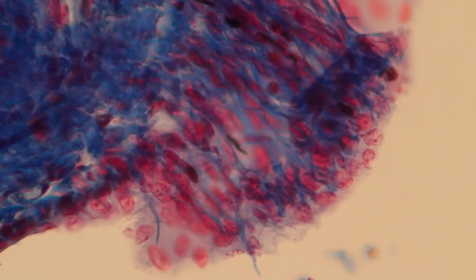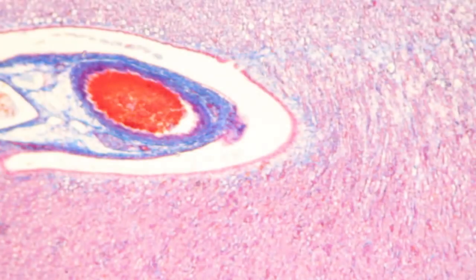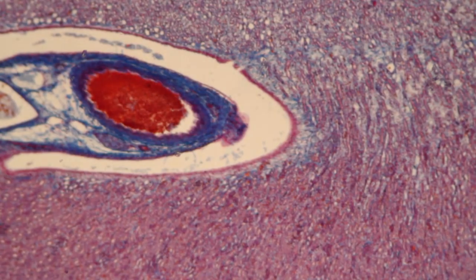It's really important at this point that you do not touch the coarse focus knob — you may crash the slide into the objective otherwise. If you would like to look at a different slide, rotate back and move the 4x objective into position, and then you can exchange the slide with a different one.